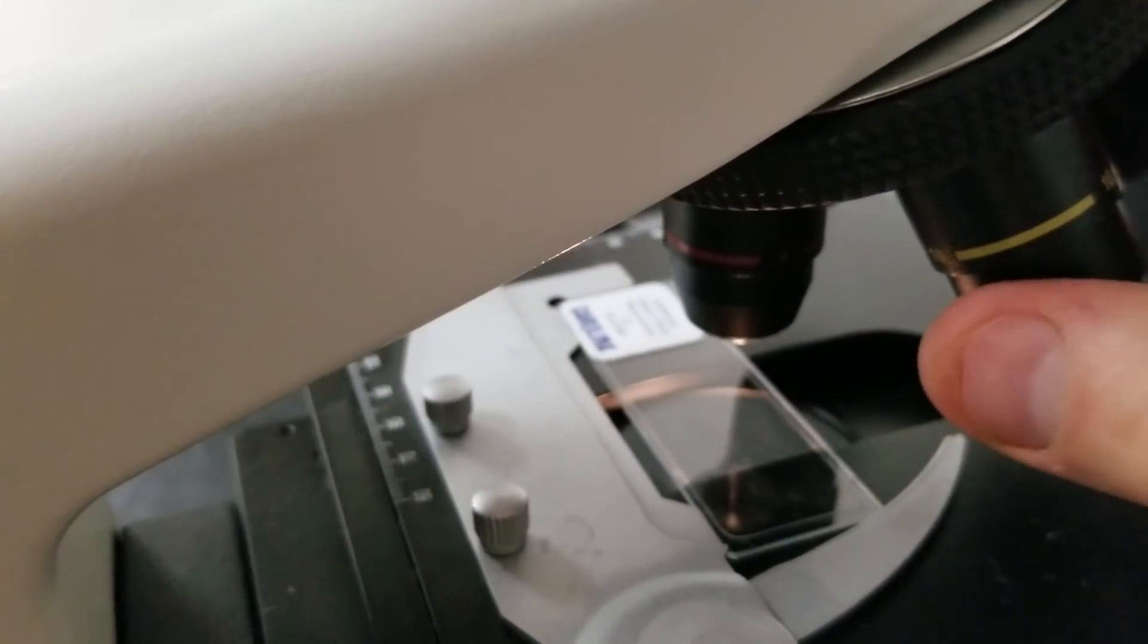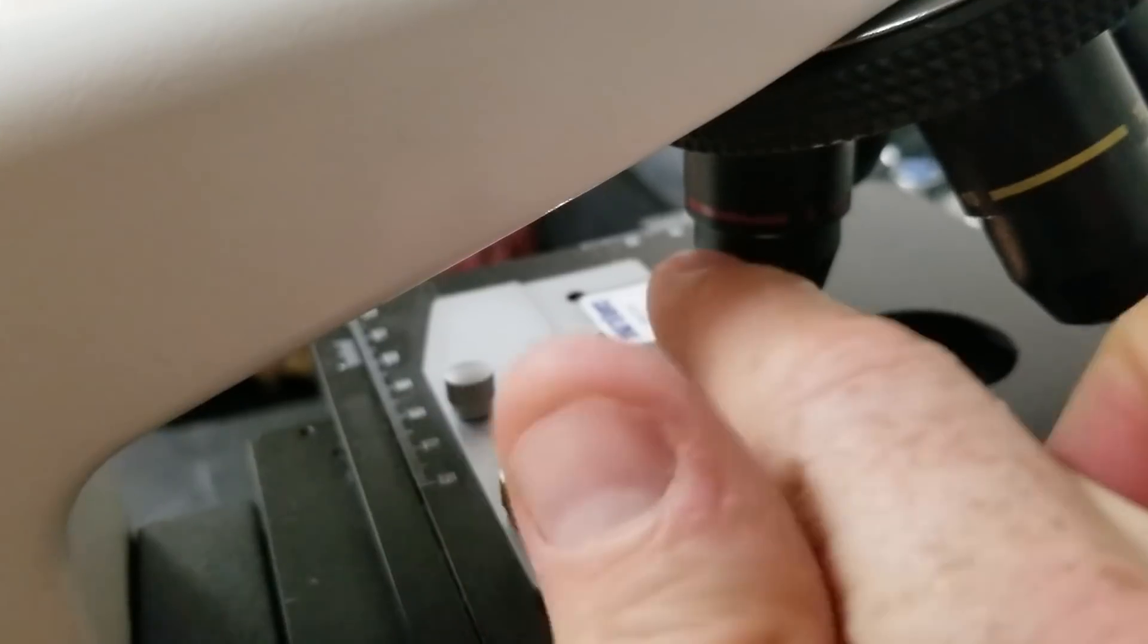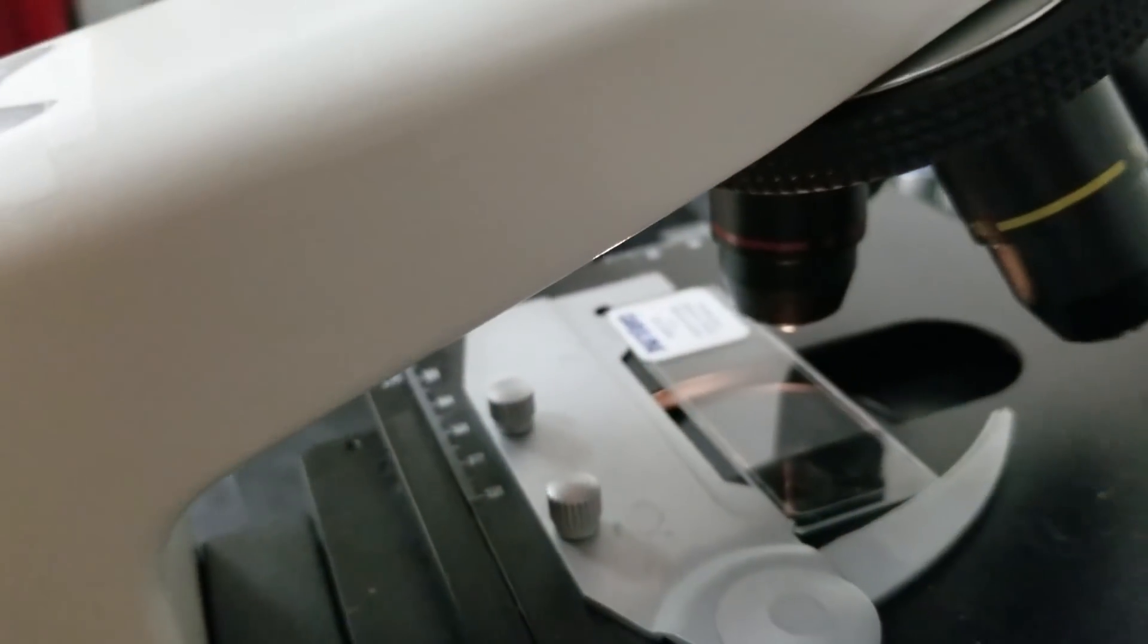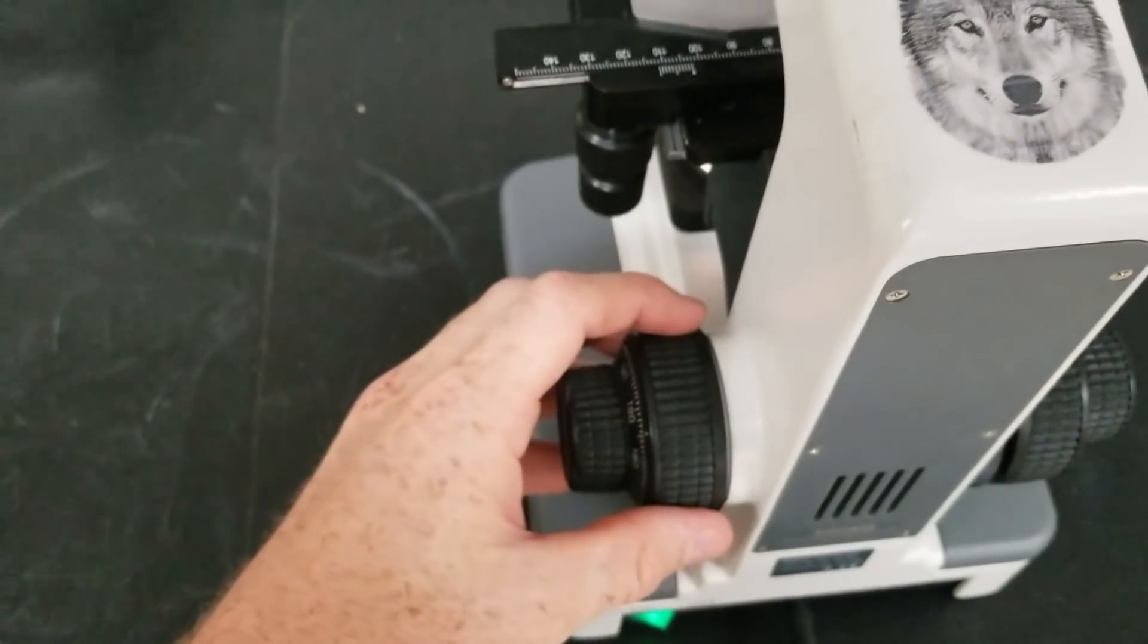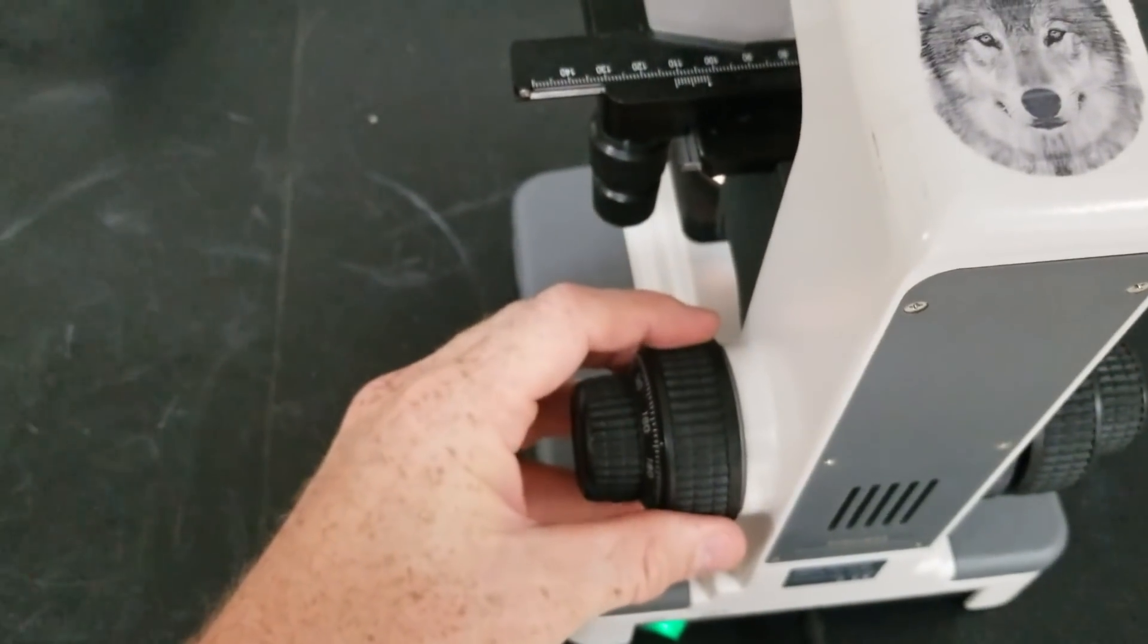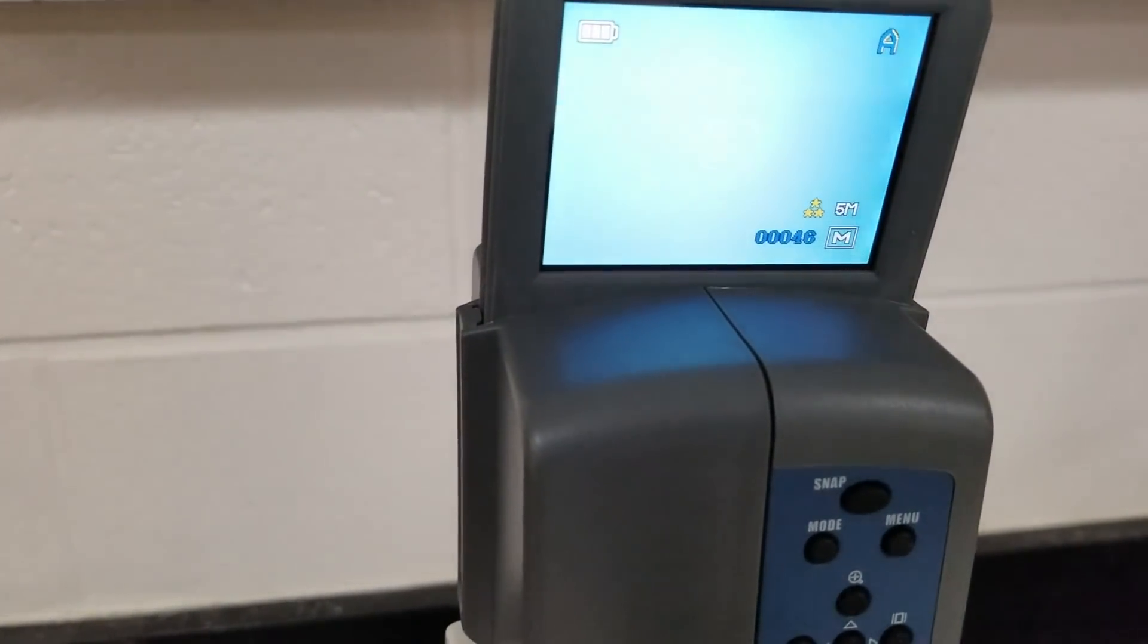You still see nothing. So I'm going to move the coarse adjustment knob, which is the big one, until I can get something to come into focus. We're going to move this and we can see little black specks start to come into focus.